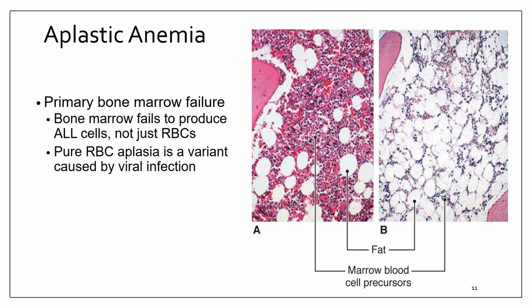This diagnosis often hinges on proper decalcification, excellent section thickness, preservation of cellular detail, and accurate fat to cell assessment. If the section is crushed or over-decalcified, it can falsely appear hypocellular. So yes, your processing matters here a lot.